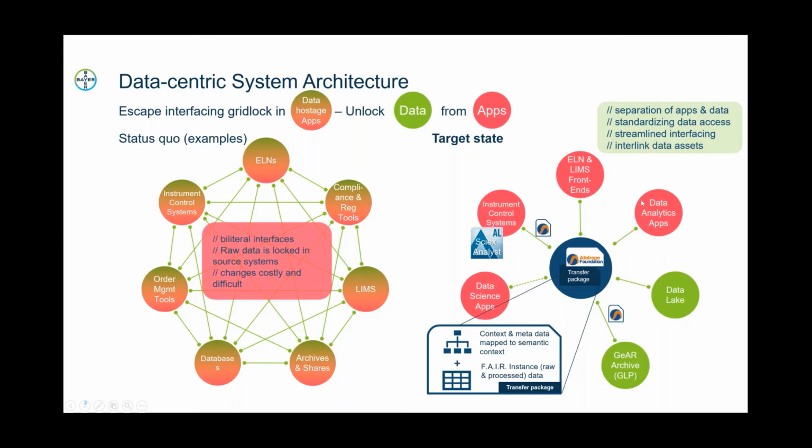The first is interfacing to LIMS. In the past, the SCIEX software has required some fairly elaborate middleware in order to transfer data into a LIMS. And then the second use case is for archival.